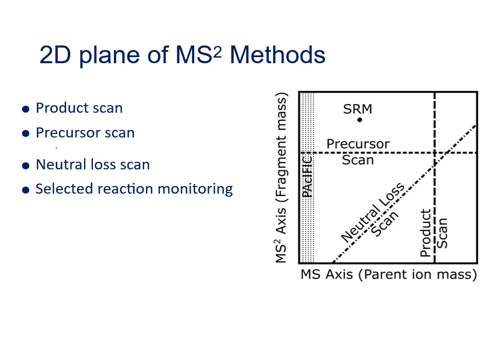So for a single injection in PAcIFIC, you record 10 contiguous product ion scans covering a relatively narrow mass range. And then across multiple repeat LC injections, you move that isolation range and the 10 underlying product scans until they cover the complete mass range of interest. And in that way, your final dataset contains a tandem mass spectrum of every possible mass across your mass range, whether or not you would have been able to detect a parent ion there in a normal mass spectrum to begin with.